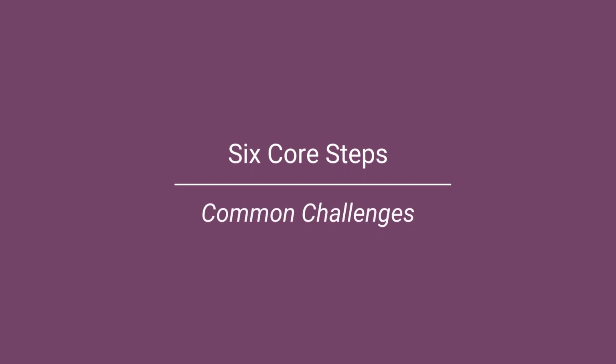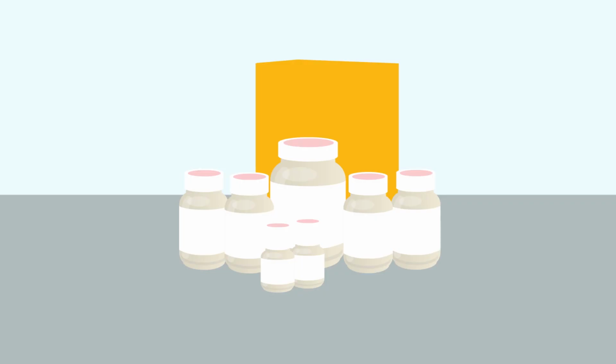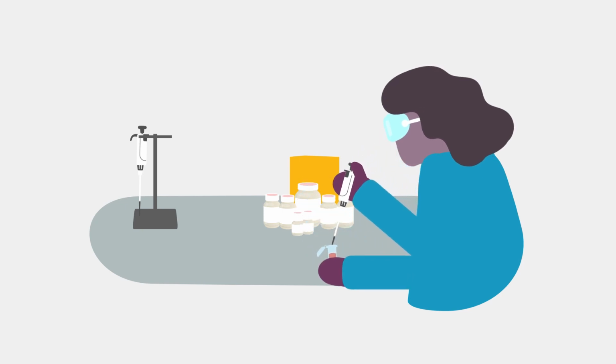Now, let's discuss other tips that will help you address the most common challenges in each of the 6 automation steps. If you're using an extraction kit, follow the recommended steps. Order of addition can seriously impact extraction performance. For example, you should only add proteinase to your sample or a mix of your sample and digestion reagents. Adding proteinase directly to digestion reagents will reduce the efficiency of the lysis and digestion step.